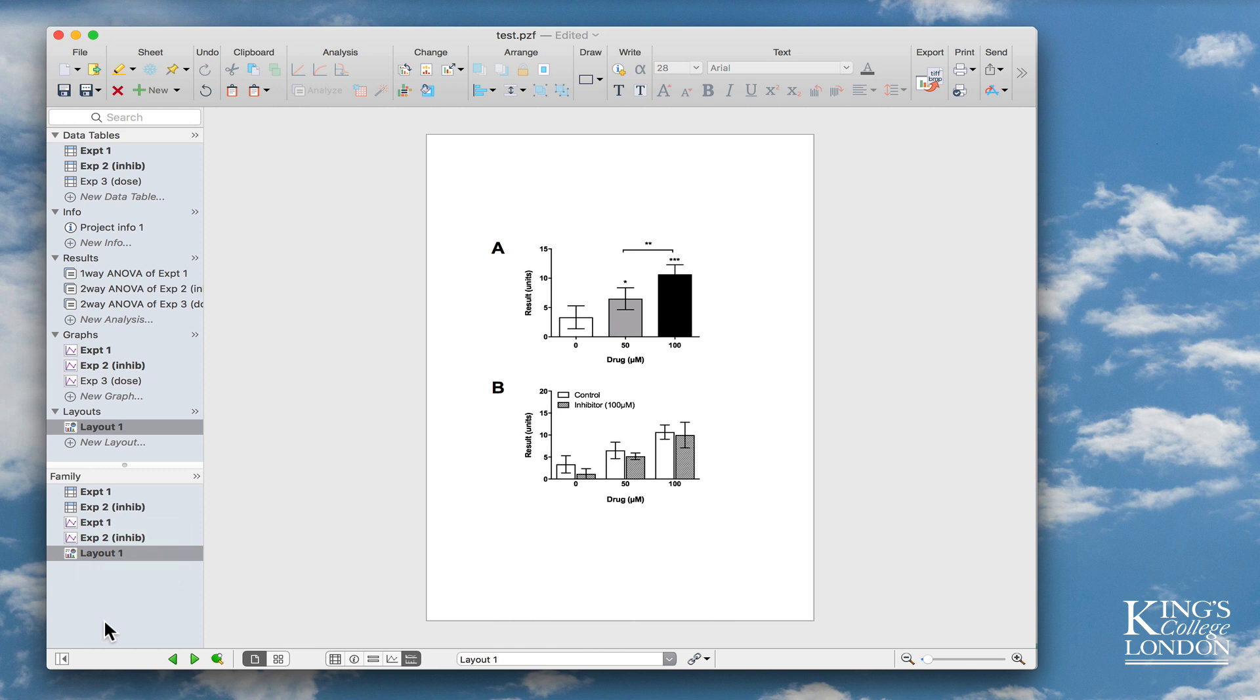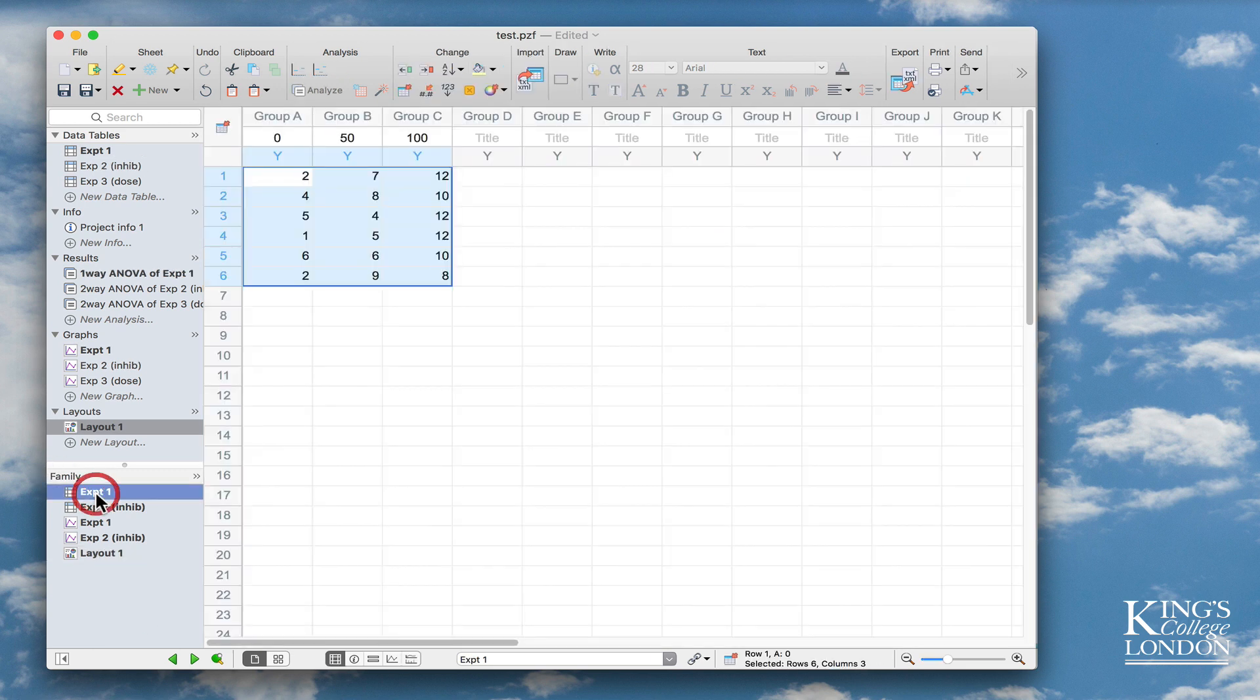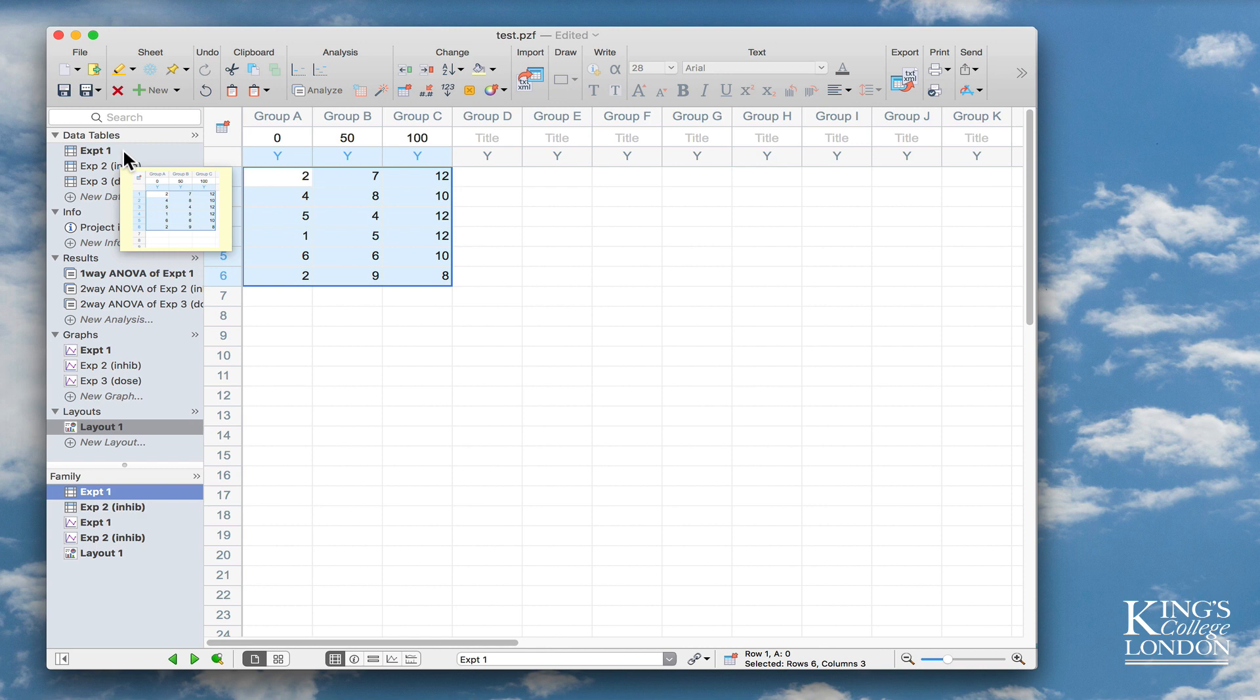It does mean that if you have multiple layouts with multiple figures, you can very quickly track down the dataset from which that figure is derived, and also the graph from which that layout is derived. So for instance here, I can immediately see that EXP1 is here, and it takes me straight to the EXP1 table.